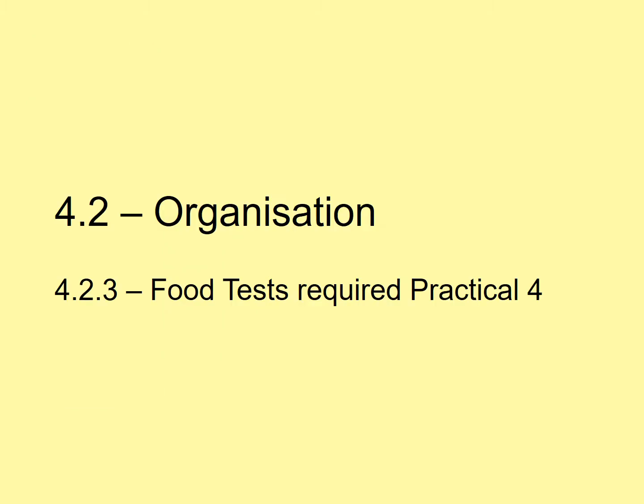The title for today's lesson is Food Test, Required Practical number 4. You can write that in your book with the title and the date and underline it, or onto a revision card if you're using revision cards.